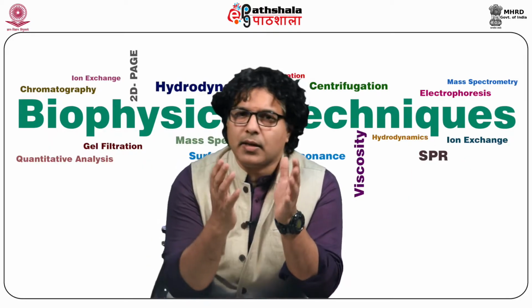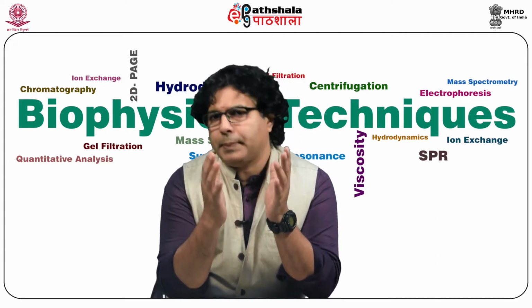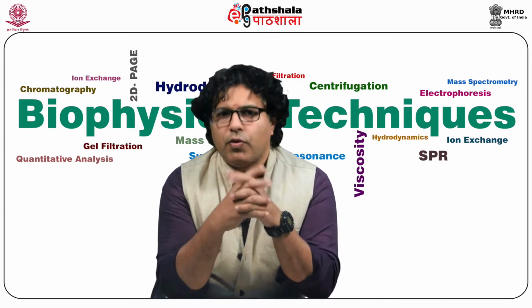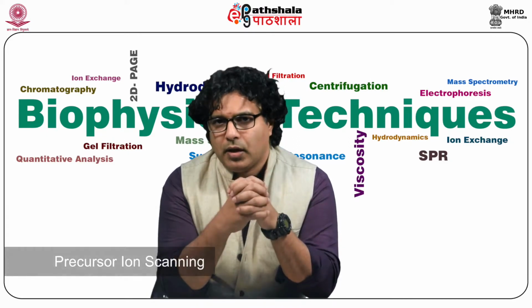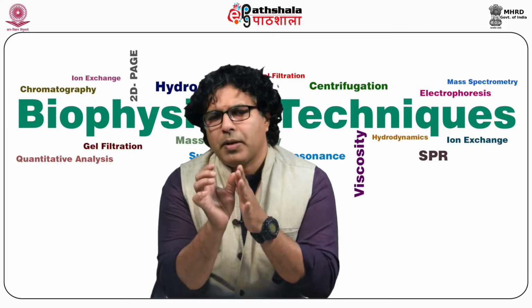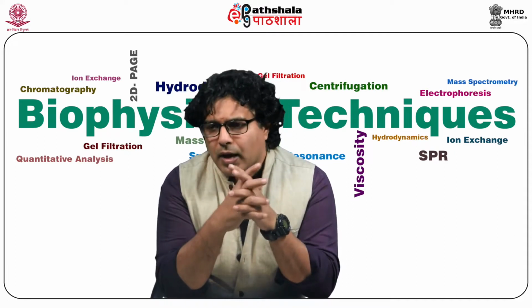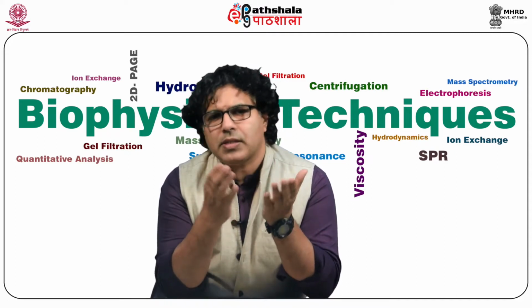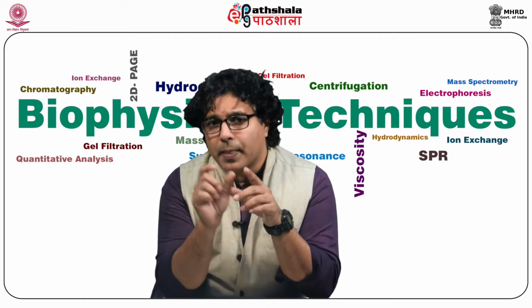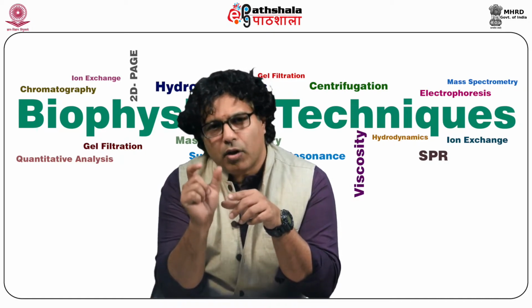Apart from classical multiple reaction monitoring or single ion monitoring in triple quadrupole type of instruments, there are several other modes of analysis that can be carried out. For example, precursor ion scanning, in which sometimes we get a uniform fragment ion coming from a species. For example, you take phosphatidylcholine, which will have several combinations of fatty acids, but whenever you look for a fragmentation, you will constantly be getting choline.